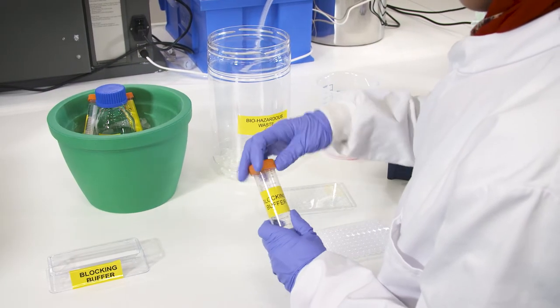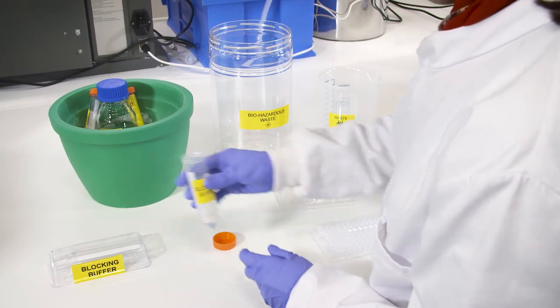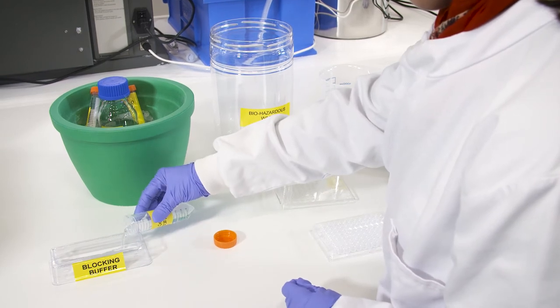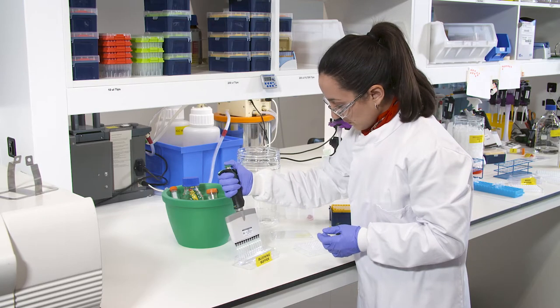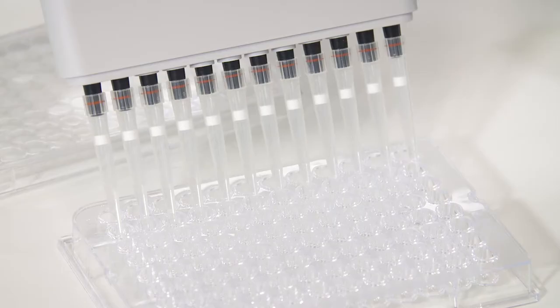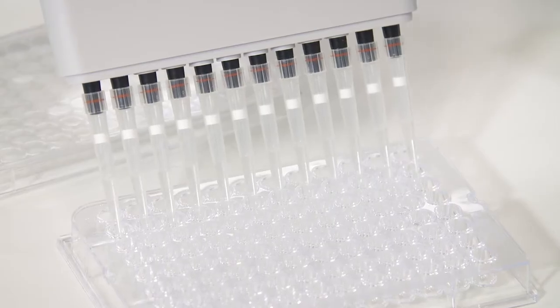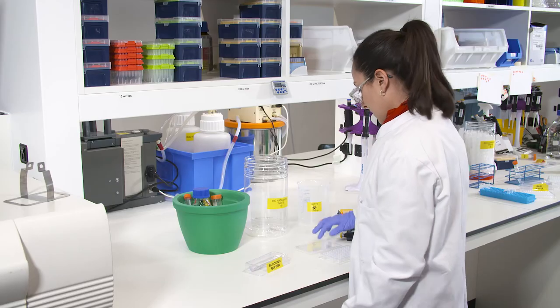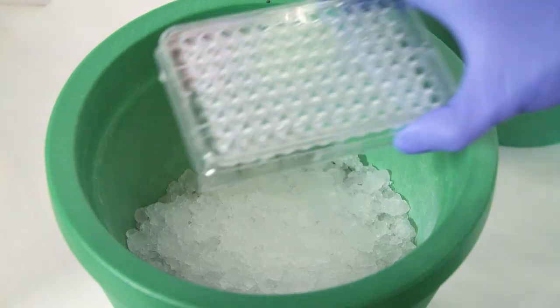Resuspend your cells in the blocking buffer which consists of PBS with 10% serum. However, the type of serum will depend on the host species of your primary and secondary antibodies. Block the cells for 30 minutes at 4 degrees Celsius.